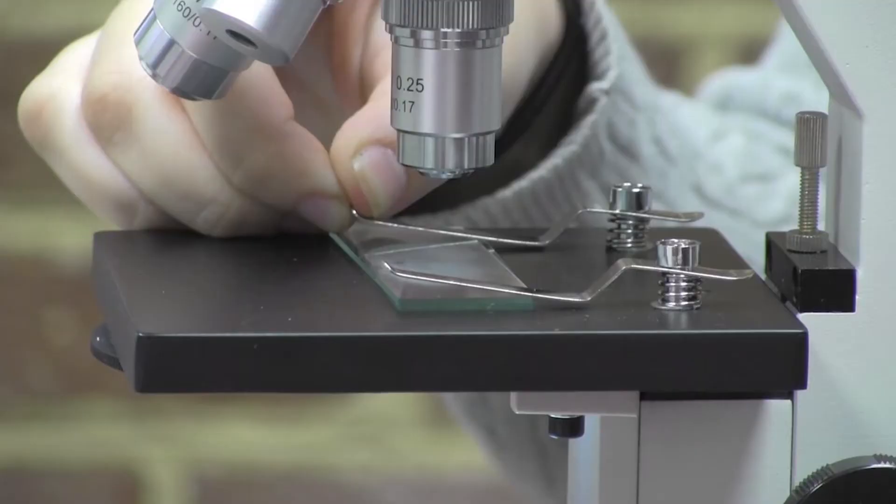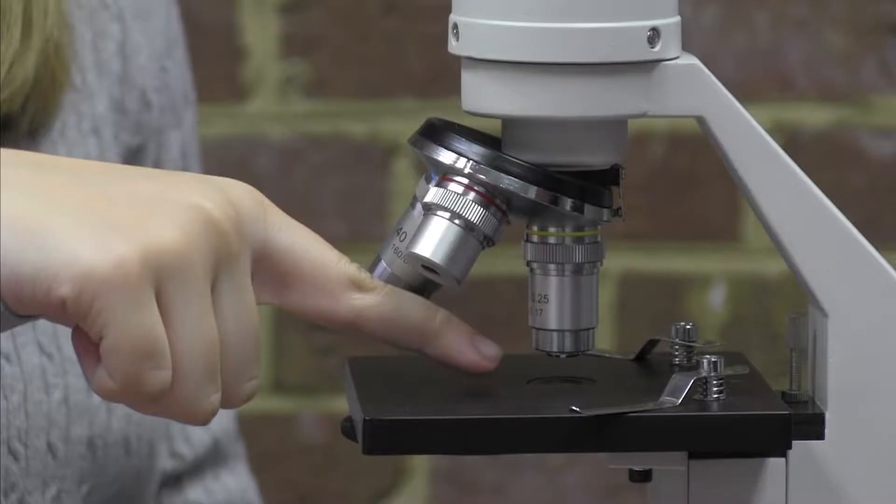Stage clips hold the slide in place as you observe. The stage has a hole in it. The size and shape of the hole is controlled by the iris diaphragm.